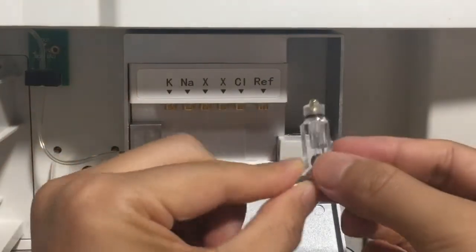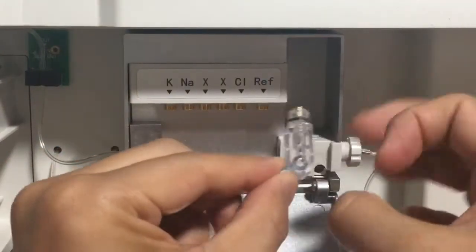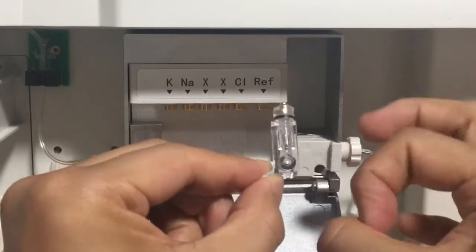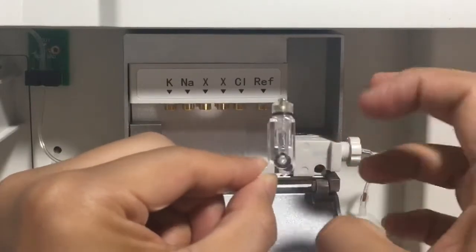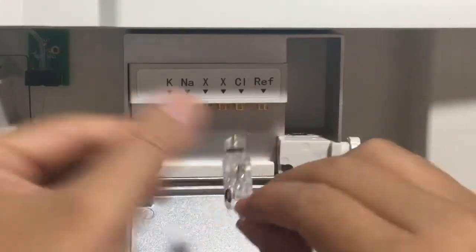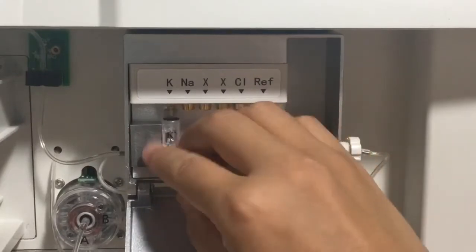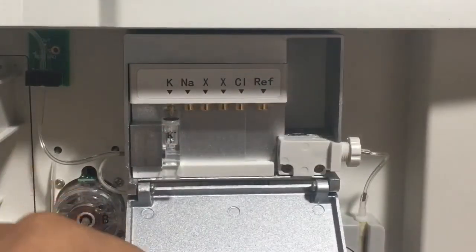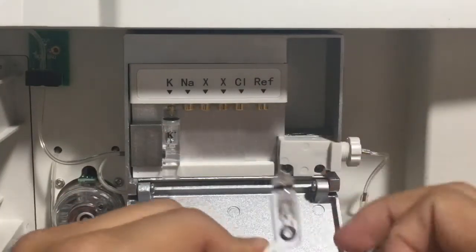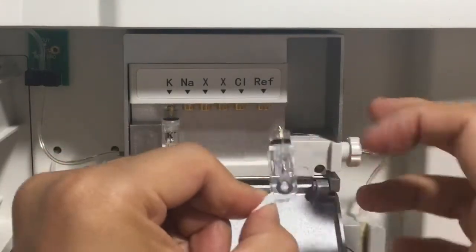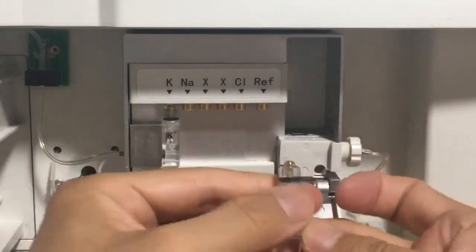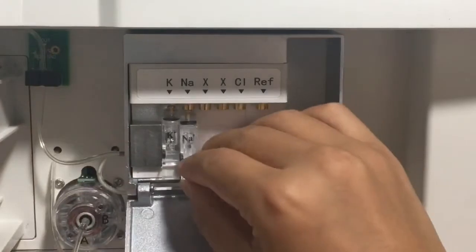We need to hold the electrode like this and use our finger to flap the bottom of the electrode. The bubble is too tiny to be seen, so every time you install the electrode you need to do this. We need to do this for each electrode.